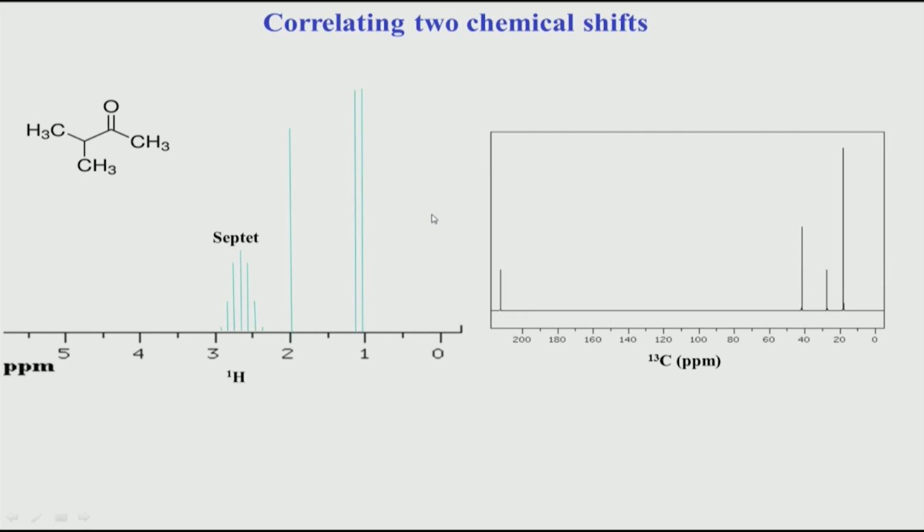So, let us take this example. Again, this is the molecule which we saw in the previous class when we were looking at carbon 1D NMR analysis. There we had a 1D spectrum of hydrogen, and we also had a 1D spectrum of carbon. But the one question which I raised last time was that there is no connection information from these two. We recorded these two spectra separately, in isolation. This was recorded initially, then you record this, but I do not know which proton peak here corresponds to which carbon peak here, because all of them are CH peaks.